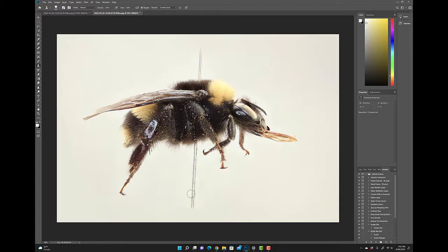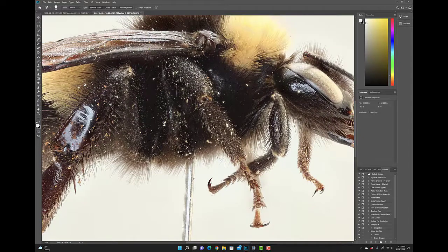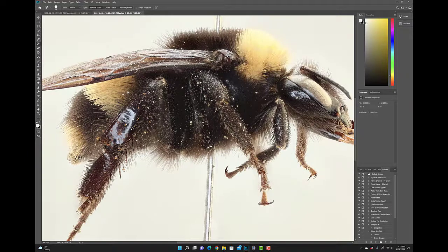You can see I went a little bit too far. We'll just click down there. And now what I've done is I've removed that blob, which was kind of an eyesore. There's also an area that's been duplicated since I used the clone tool, so I can just get rid of that using the Band-Aid tool and so forth. But now let's focus on the task at hand, which is to make sure these dark areas are seen without ruining the integrity of the image.